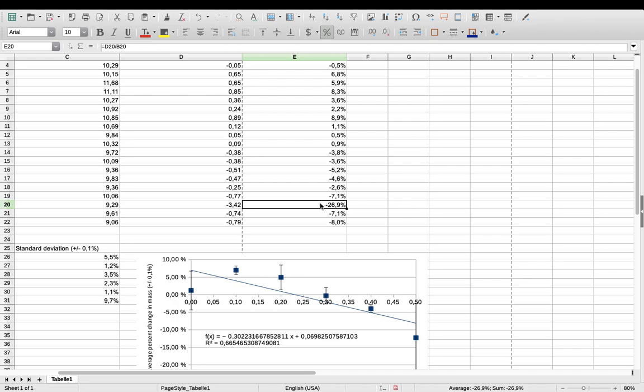At this point, it would be really important to go back to your notes that you took for yourself during the lab, during your experiment, to find out what might have happened here. Maybe it was just a copying error. Maybe you misread your numbers, your handwriting or something, and you can solve it that way. If everything seems to have gone correctly in your experiment, or you can't find an easy explanation for it like that, then you generally need to go back and repeat this measurement to see which of these data points are the correct ones. If this is the correct data point and these three were all mistakes due to some measurement error, we need to know that.